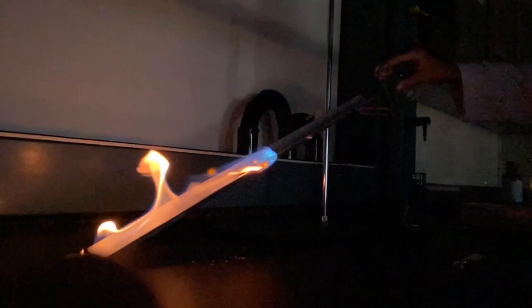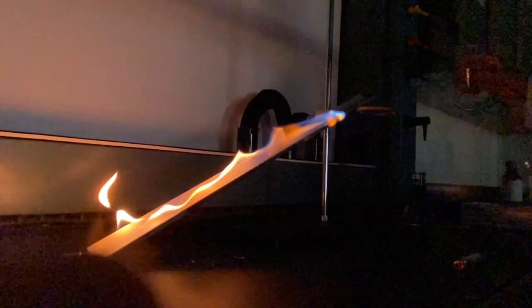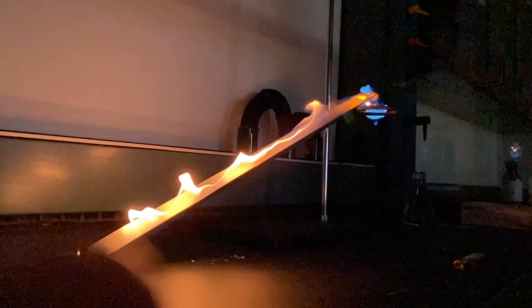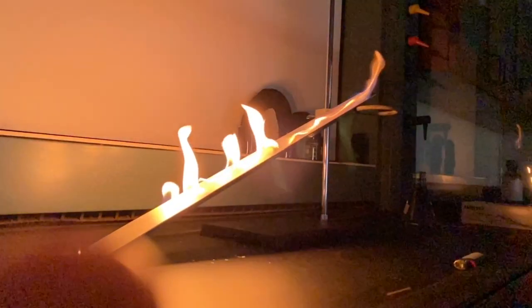If I left my hand there once the flame reached the top, the entire Erlenmeyer flask and its contents would burn and I would burn my hand. This is why we need to keep flammable liquids away from a flame.